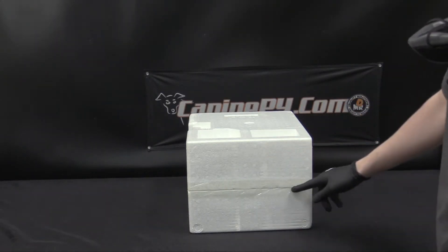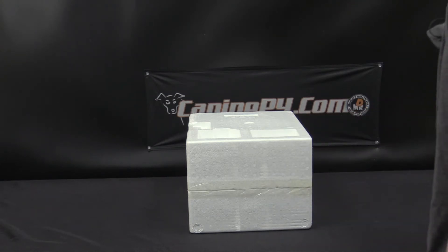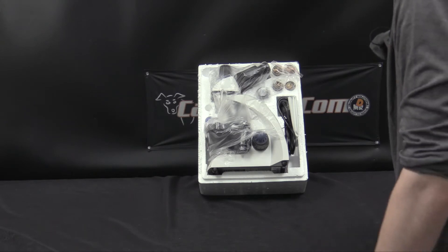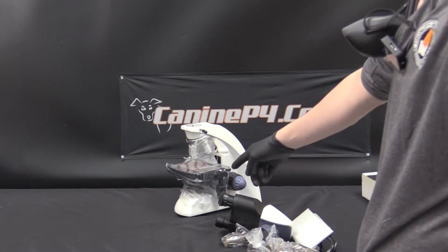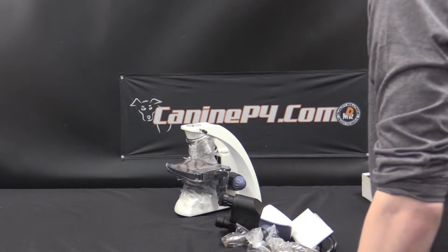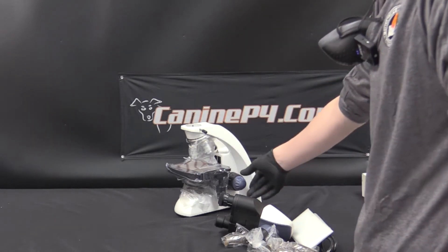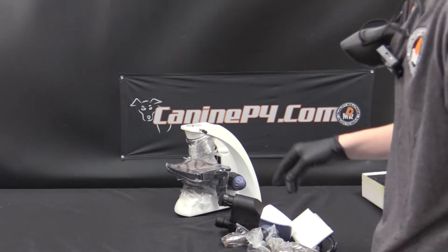We'll just need to cut alongside the middle of the styrofoam to get all the contents out. It's going to be mostly set up already but we will just need to do some setup with the LCD screen and also the eyepieces. The major piece includes the base, the light source pre-installed, the different objective lens pre-installed, the fine and course adjustments, and the mechanical stage. We'll go over that in more detail in the using microscope training video.